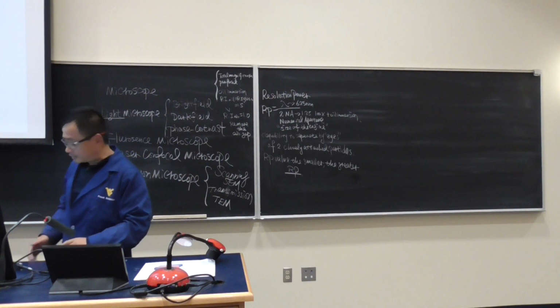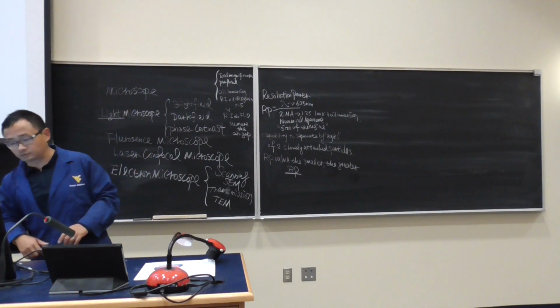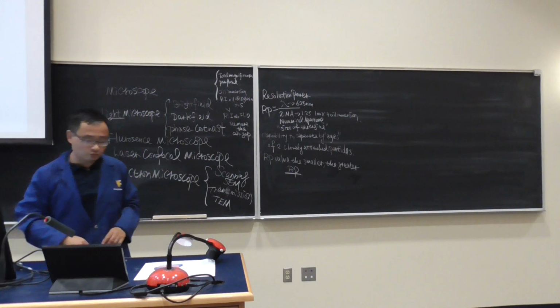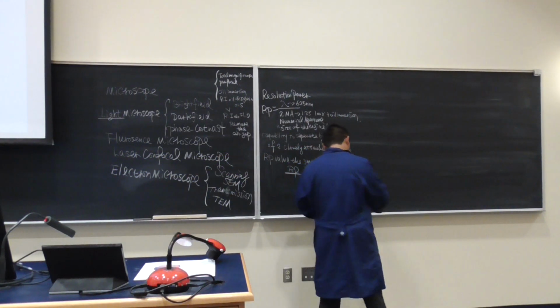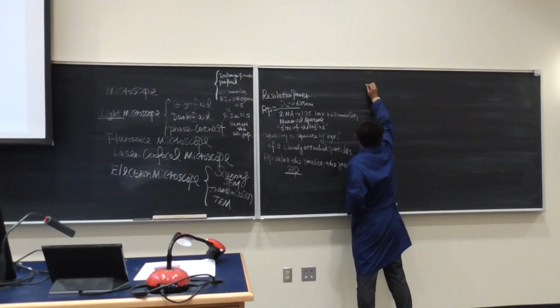We are mainly going to spend time talking about other microscopes. So the first one we want to introduce here is the dark field microscope. So what is that?